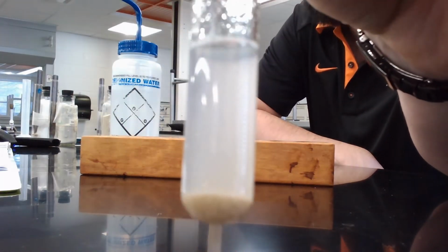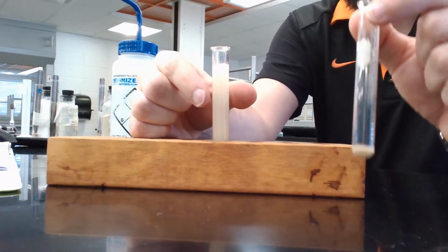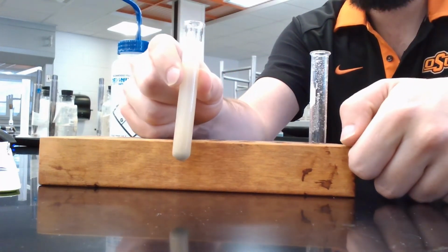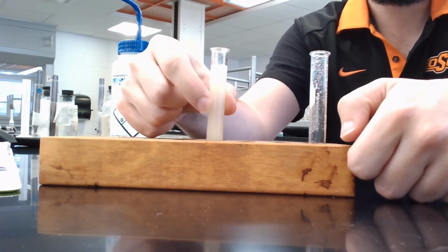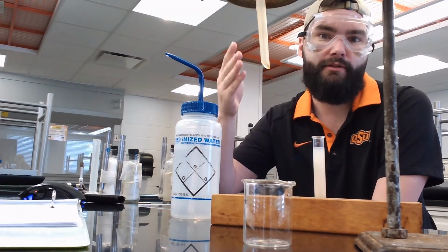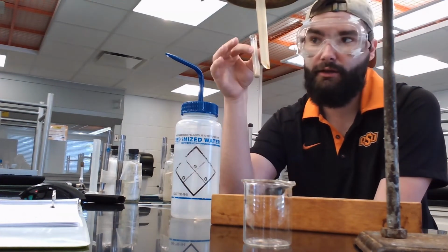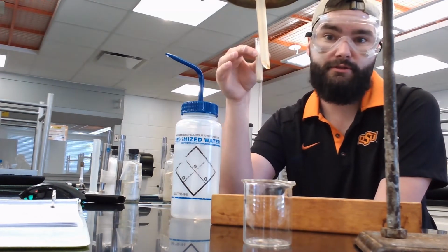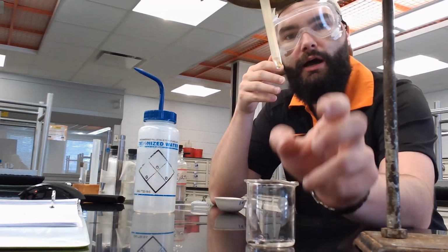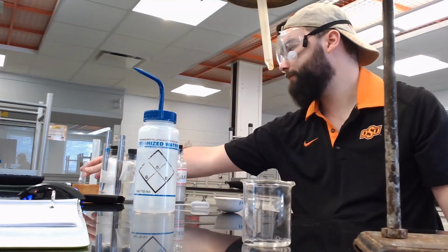Alright, so this is what it looks like after my last rinsing. So now I have my sand separated here, and I have my salt and silt here. So now the next thing to do is separate off the silt from my salt. So to do that, I'm going to go ahead and pour this through my filter. While we let this filter, I can go ahead and start drying out my sand.